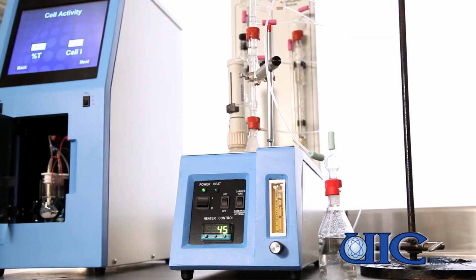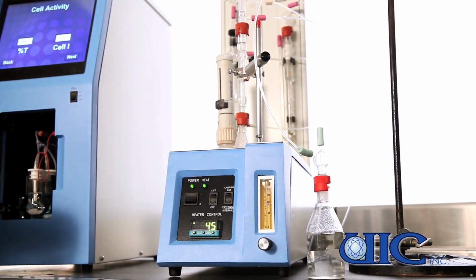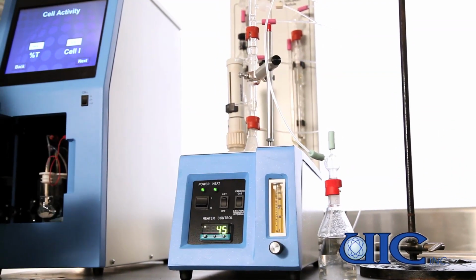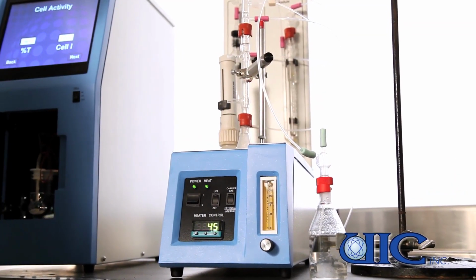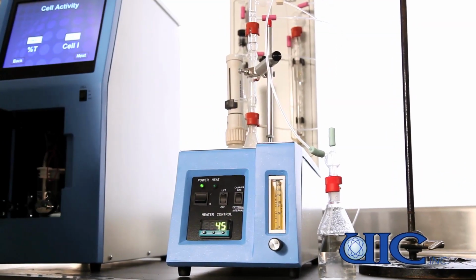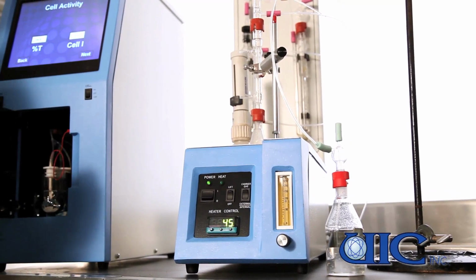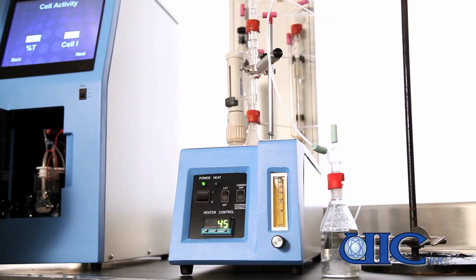Most amine samples will contain a fair amount of hydrogen sulfide. Therefore, we use an auxiliary scrubber here, which contains a 10% silver nitrate solution, and then we use another post scrubber that contains the same 10% silver nitrate solution. We use the smaller scrubber that's mounted up on the instrument mostly as an indicator to tell us when the main scrubber has been expended.